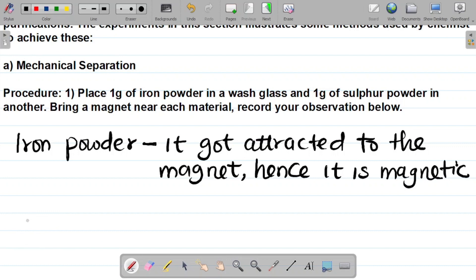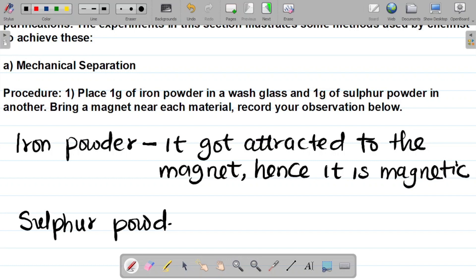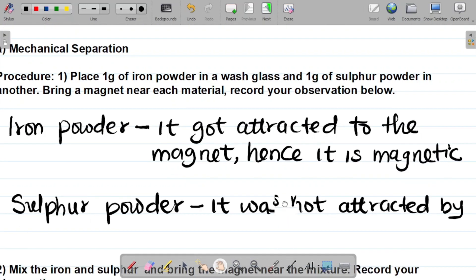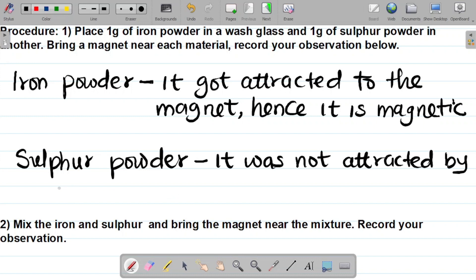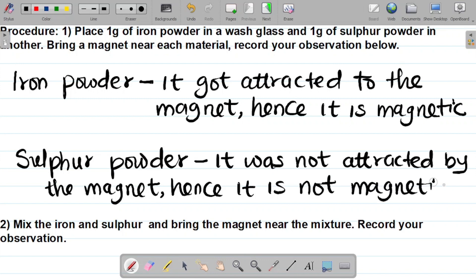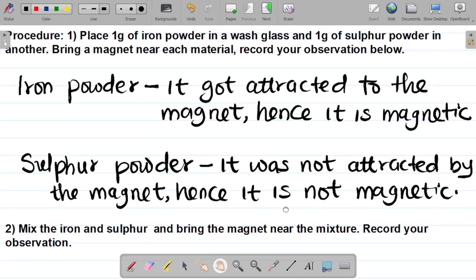Next is the sulfur powder. For sulfur powder, when I brought the magnet close to it, there was no reaction. It was not attracted by the magnet, hence it is not magnetic. So I've now recorded my observations for both materials.